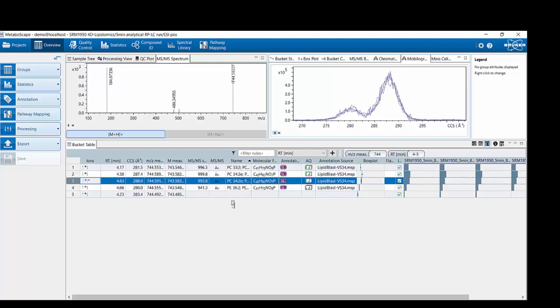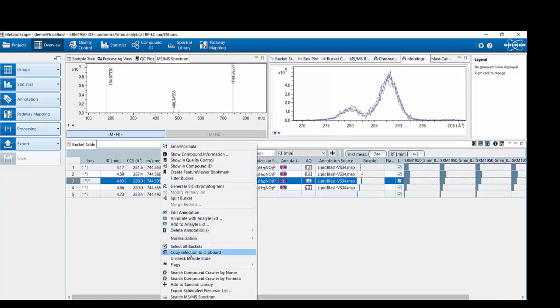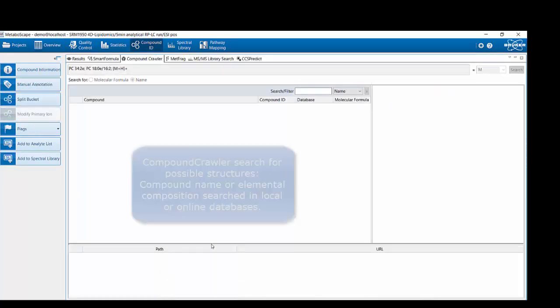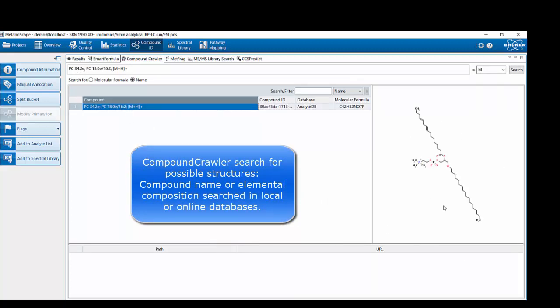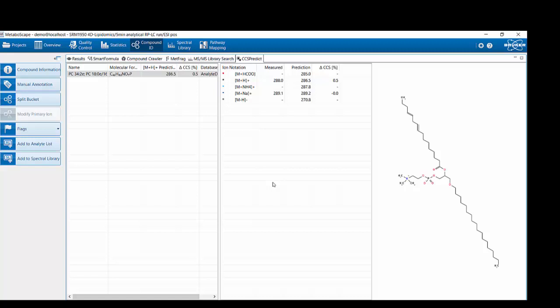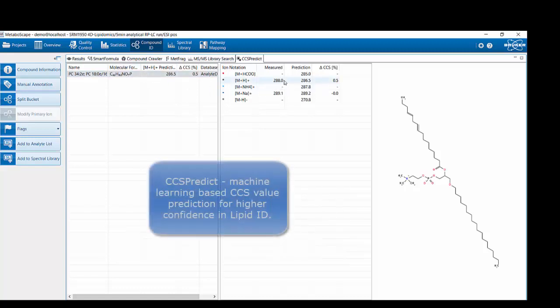To further increase our confidence that we are looking at a lipid class of PC 34:2E, we can search the local AnalyteDB by name. Searching for PC 34:2E gives a result for a possible structure. Performing the CCS prediction, the measured CCS value of the M+H and the predicted value from CCS PREDICT — a machine learning algorithm based on the concept from Zou et al.'s LipidCCS — deviate by only 0.5 percent.